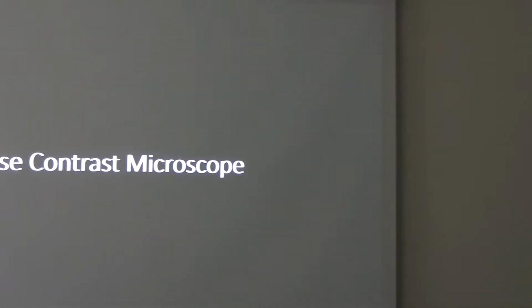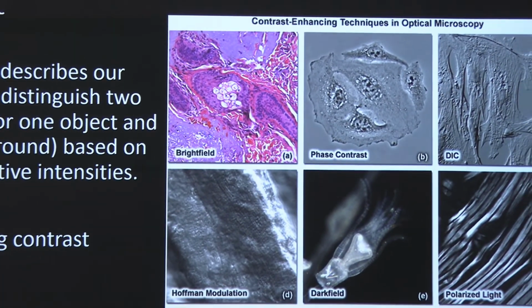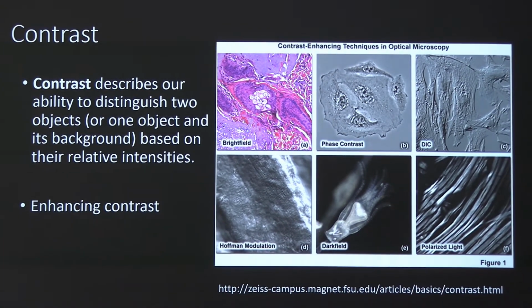So in this section, I will introduce you the knowledge of phase contrast microscope. It's very important because you will use it in your exercise 3. So at the very beginning, let's see what is contrast.